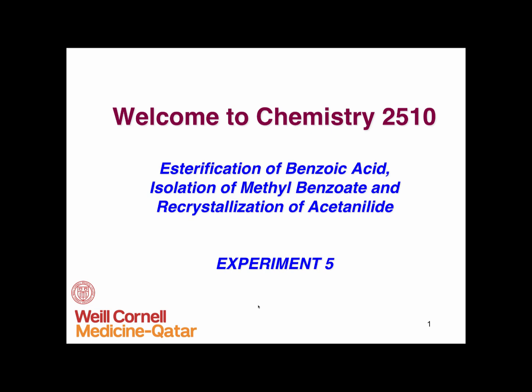This week in the lab we're going to do the esterification of benzoic acid using a Fischer esterification. And then you'll also do the recrystallization of the acetanilide that you separated out in the previous experiment. So in lab 3 you separated benzoic acid and acetanilide, and the acetanilide's been sitting in your locker. We're going to have a chance to go back and recrystallize that this week.